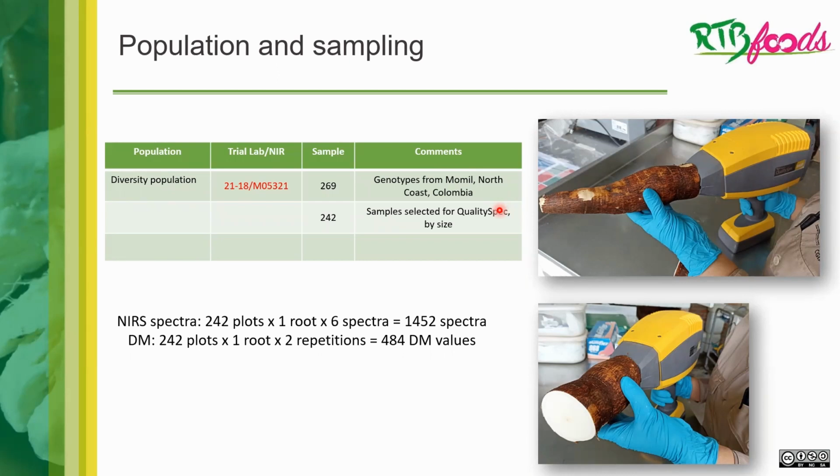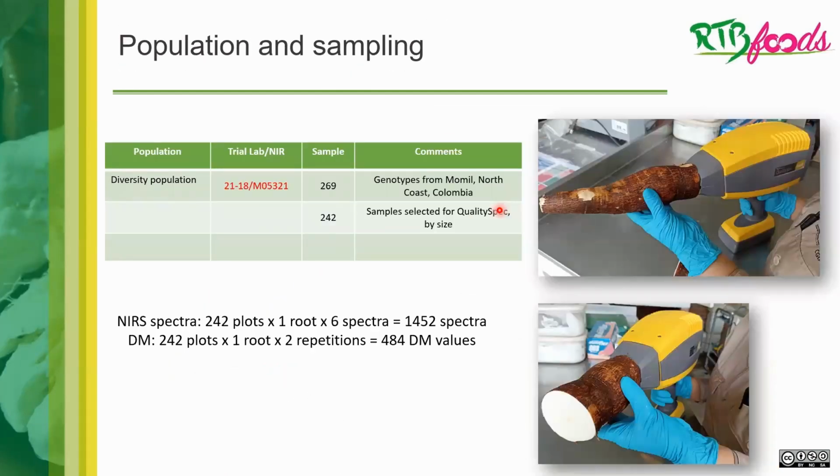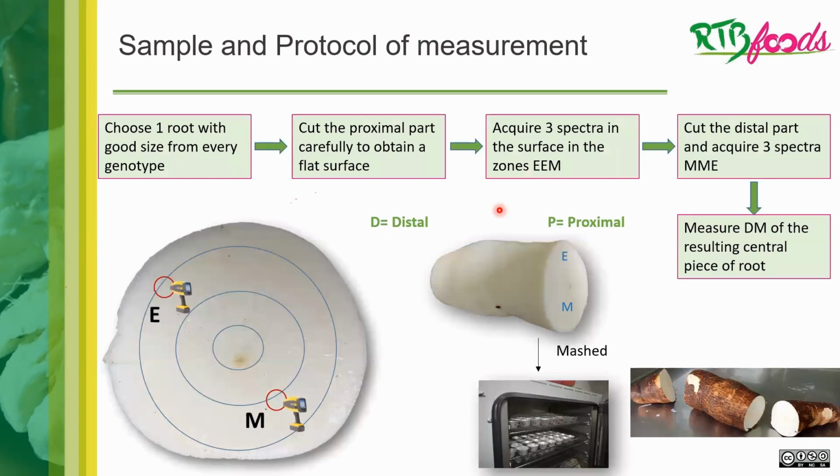Not for replication. No, for genotype, because we did the dry matter for this piece only. With this piece we did the spectra and we did the dry matter of this piece. For all the genotypes we did it too with several roots, but you know that one root is not significant for the whole plant or the genotype. Yes, I understand.